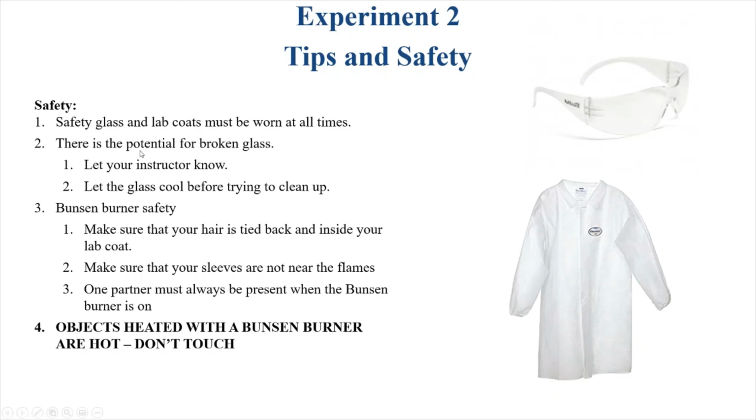In this experiment, we have to always be cautious of broken glass. It's very common for students to break glass. If you were to break glass in the lab, you would let us know. And it's very important that you let glass cool before you try to clean it up, because a lot of times we're heating things up on the Bunsen burner, and it may even break while it's on the Bunsen burner. If that happens, we have to wait for everything to cool down, shut the Bunsen burner off, and then we can go in and clean it up so that we don't get burned.